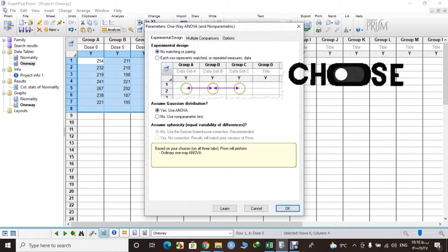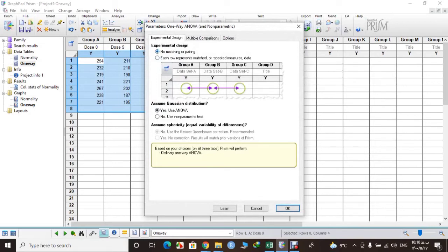And here they ask if our data is matching or not. For example, if you measure blood pressure after and before treatment, data will be paired. But our data, no, they are not paired. So we will just let it as it is.